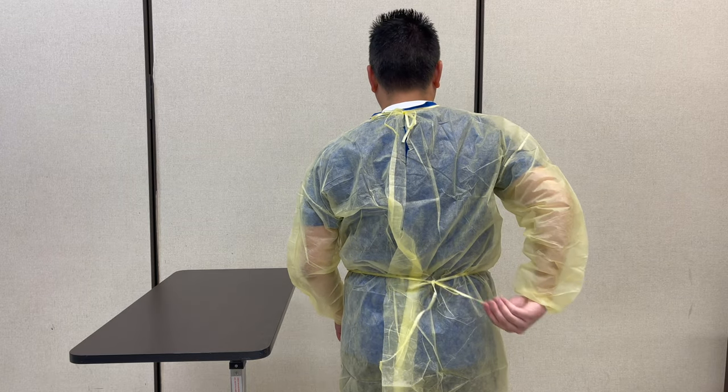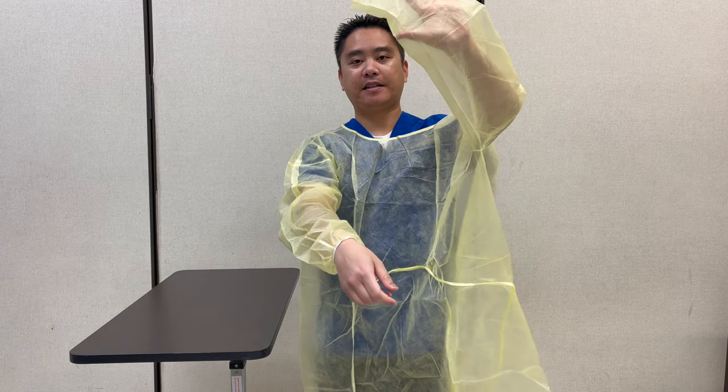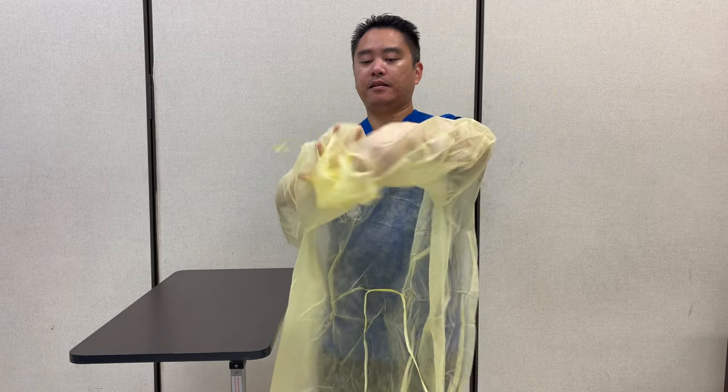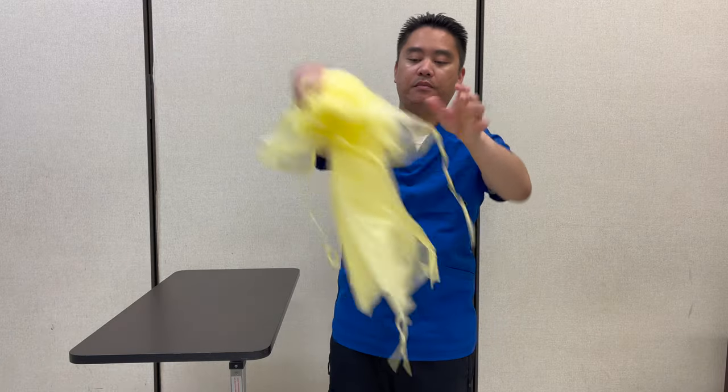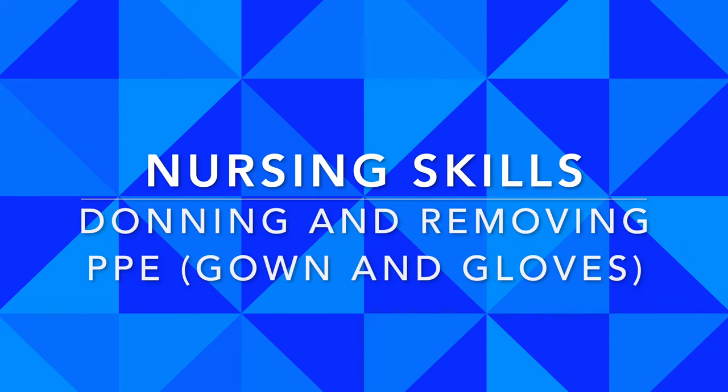This goes into the biohazard. And when I remove the gown, I'm going to start with the bottom and then the top strings. Then I'll use one of my fingers to pull the cuff. The hand that's in the sleeve, I'm going to pull this side and then roll it away from me. I'll just do it halfway. This goes into the biohazard, and then wash hands and then step outside the room.